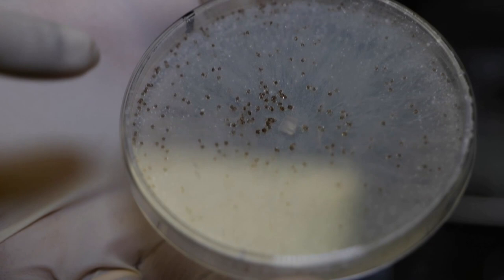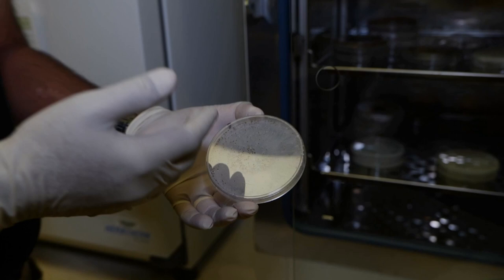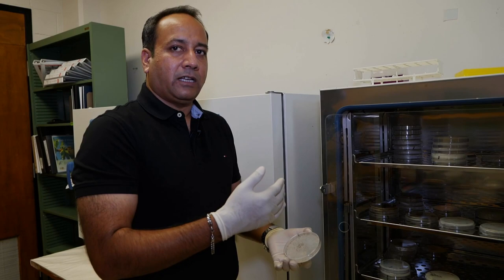Again, we have to make sure that we have what species - there are different species of the same genus, so we have to figure out based on molecular tests like sequencing, DNA sequencing, on what that particular species is.